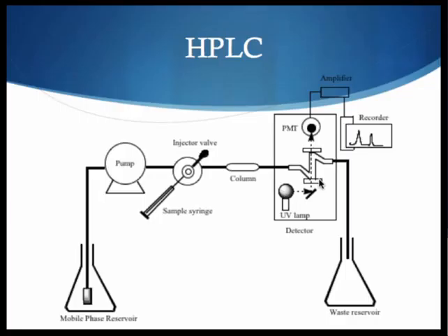And just remember that the photomultiplier tube is used for small signals, and it works by having one photon bounce off of a plate, and each time it hits a plate, the electrons double, which make the signal measurable. And so once the signal is recorded, you will see it pop up on your computer screen, and then the solvent and the sample are ejected into the waste.